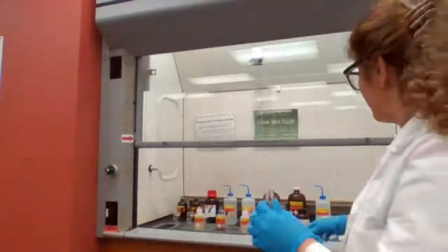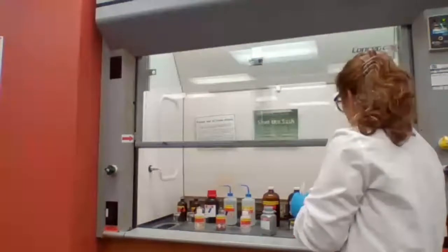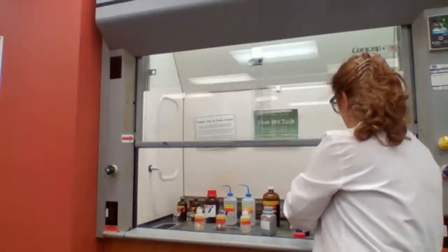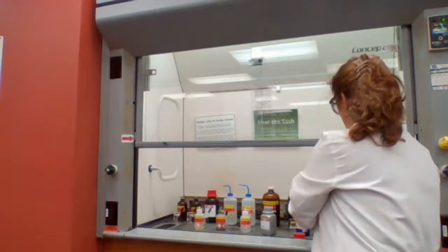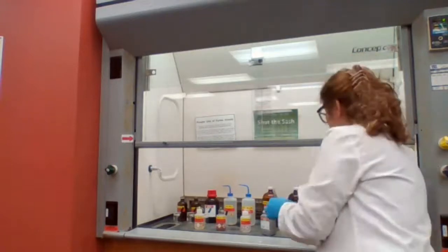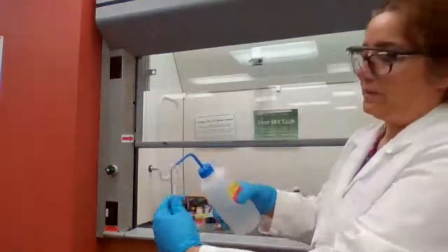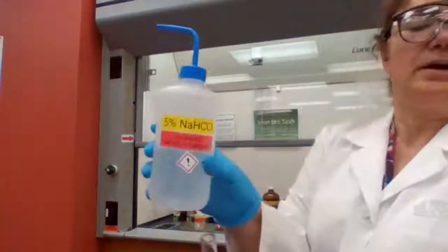Okay. And the next step is benzoic acid in sodium bicarbonate.